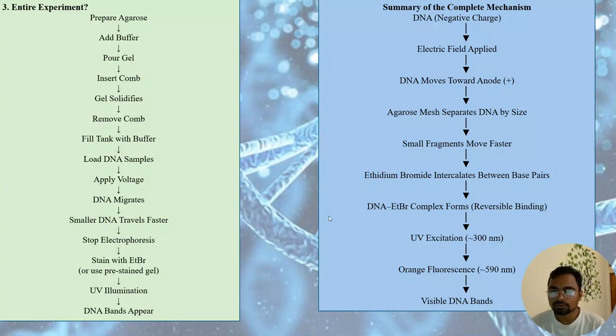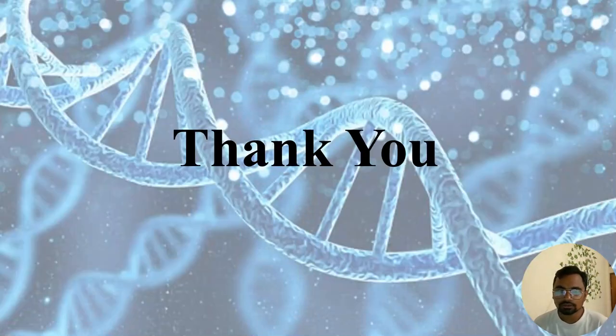So this is the whole lecture. Throughout, we have discussed what to do from agarose preparation and gel casting to DNA analysis, how the whole process works, and what mechanism is working behind it.